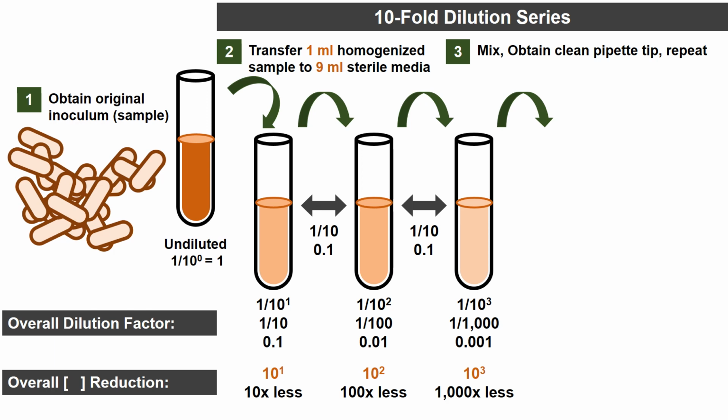Let's keep going. Another green arrow. You guessed it, that's 1 ml. Here comes another test tube, looking a little less orange. And that was because we mixed it with 9 ml of diluent. This is the fourth tube, but if you look relative to the third tube, it's a tenth less, just like each of the previous examples. 0.1 apart.